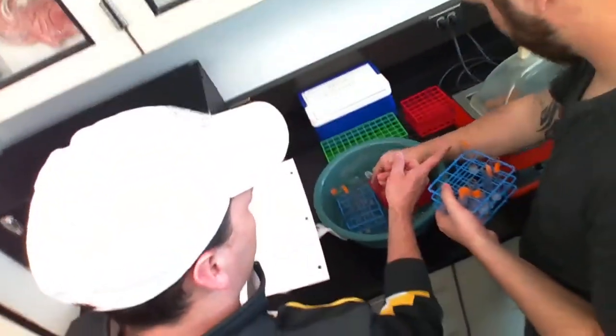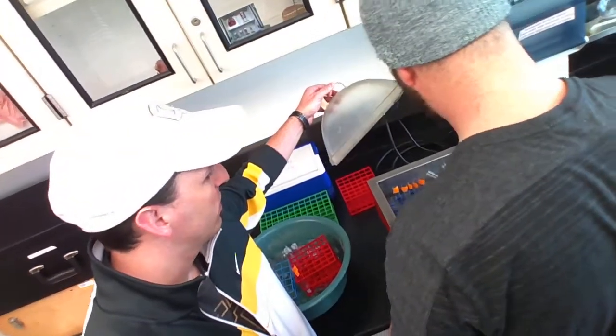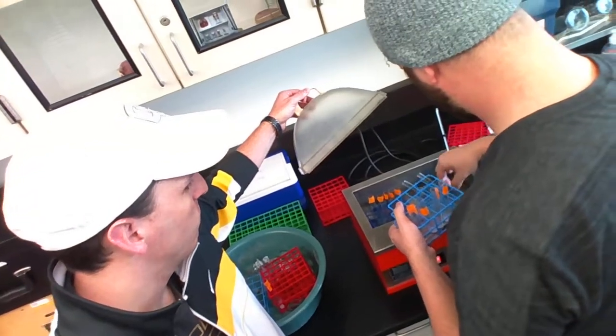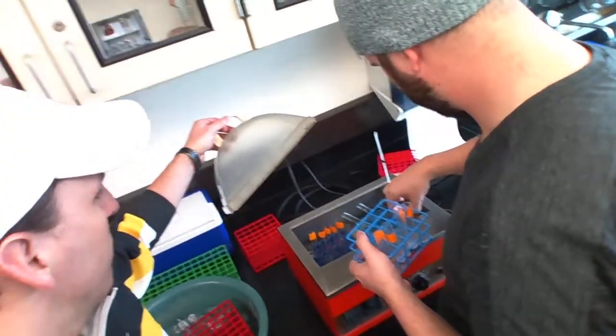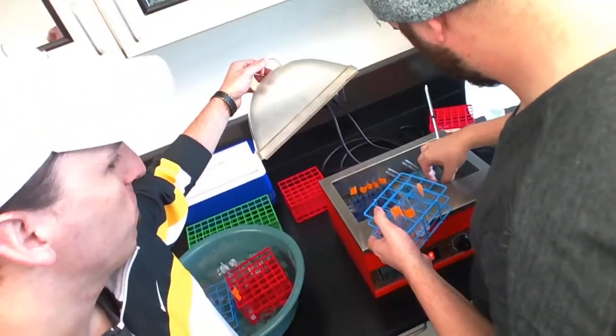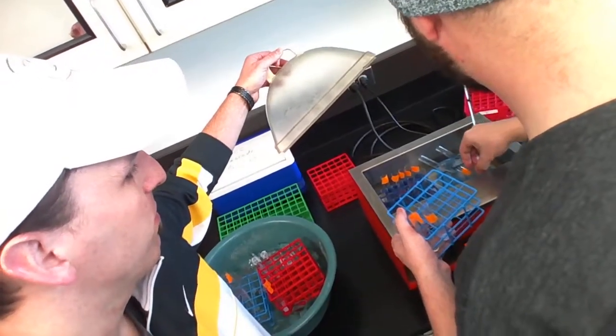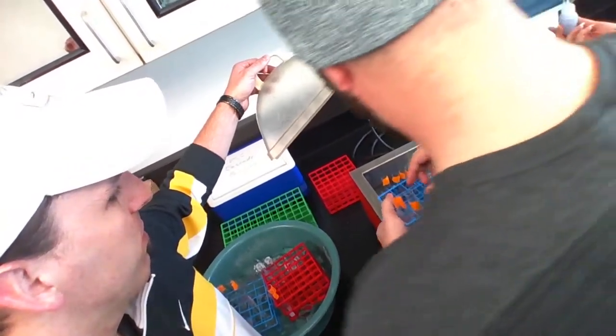Everything else goes in that one. So they're basically sticking all of the other ones into the incubator that's holding them at body temperature.